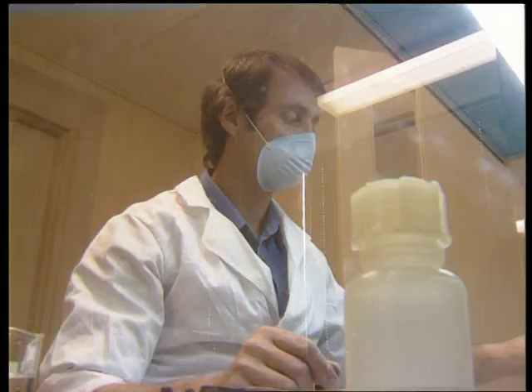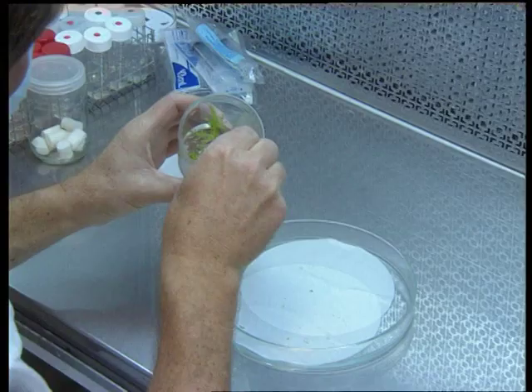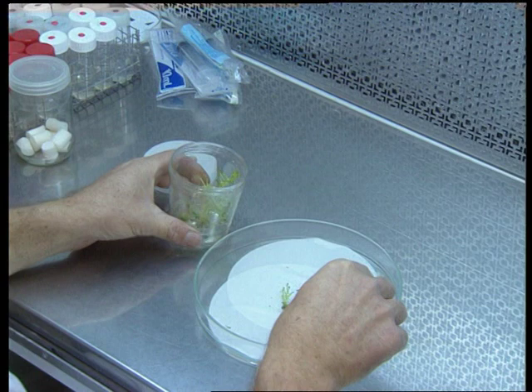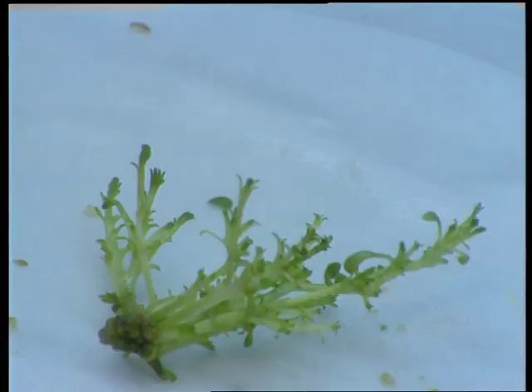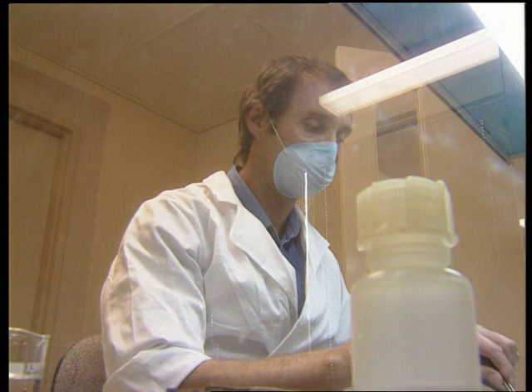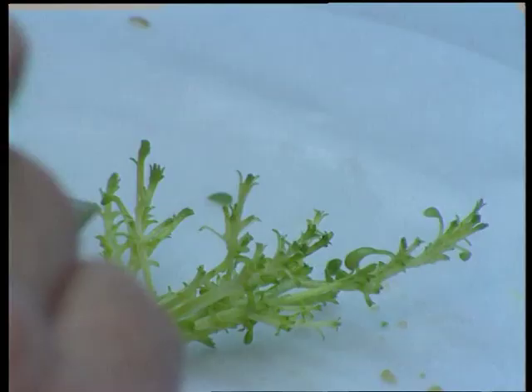The third method is to include an elongation phase by placing the propagules into a medium without cytokinin or at very low levels of cytokinin for 2 to 3 weeks, and in some cases adding gibberellic acid. This may be necessary when numerous short shoots have resulted from the multiplication stage.